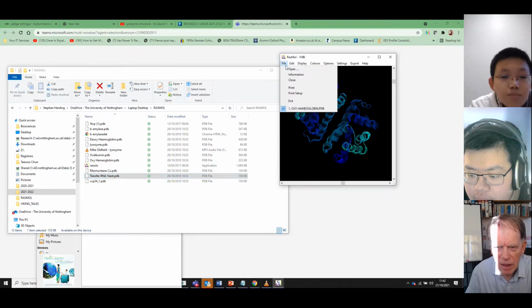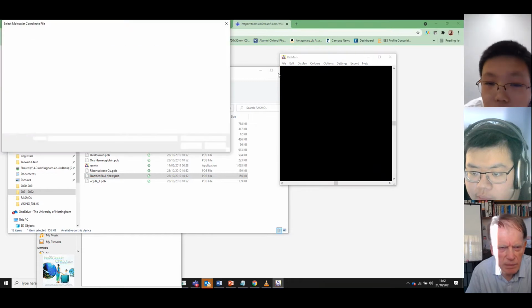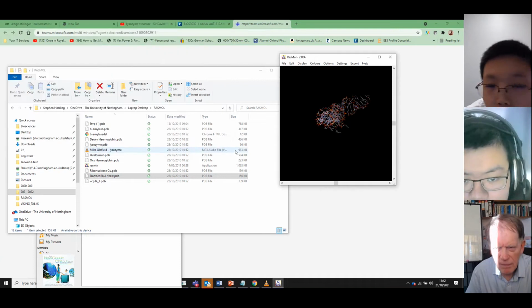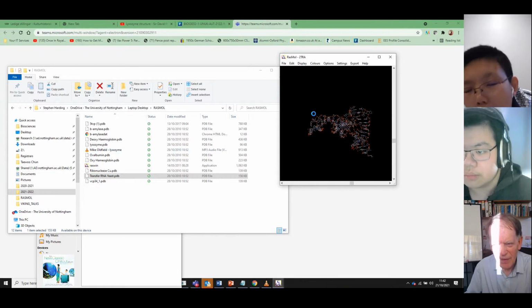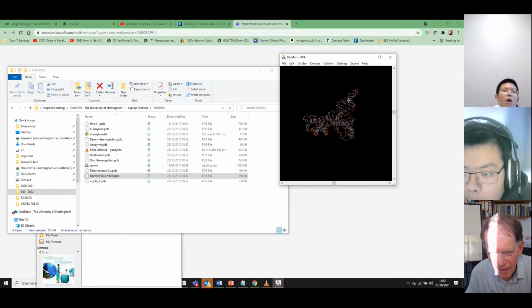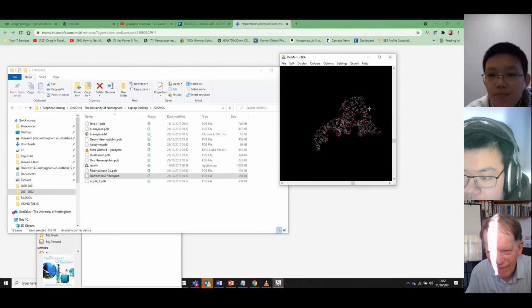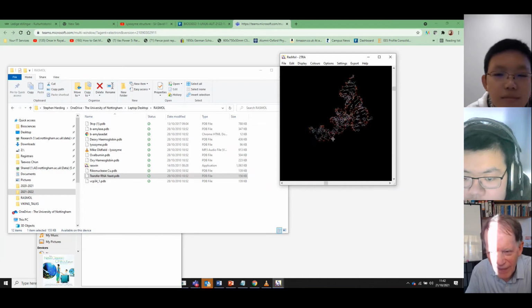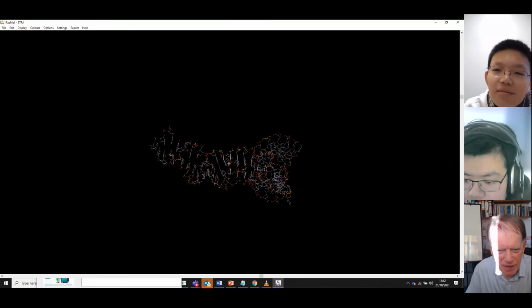Let's just close file, open. All right, that could be useful for when we talk about nucleic acids, I think next time. I'll twist it round. Okay, you can have quite a bit of fun here playing with this. Better expand it out. That's better.